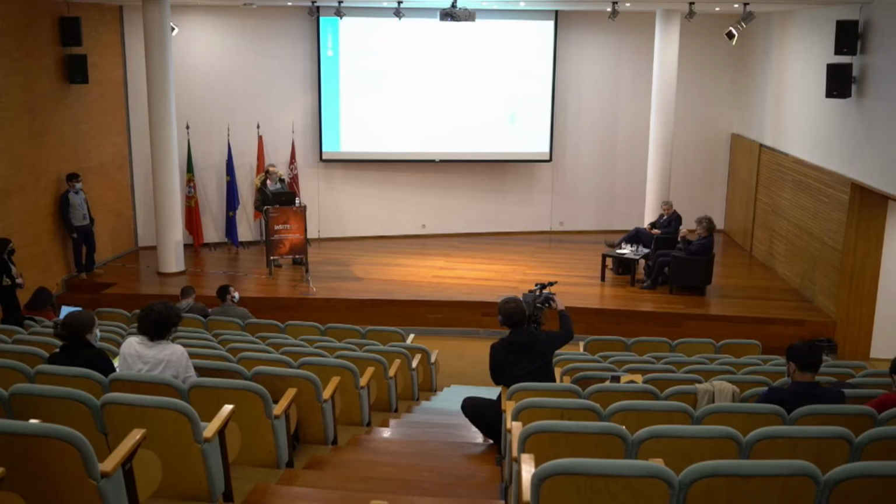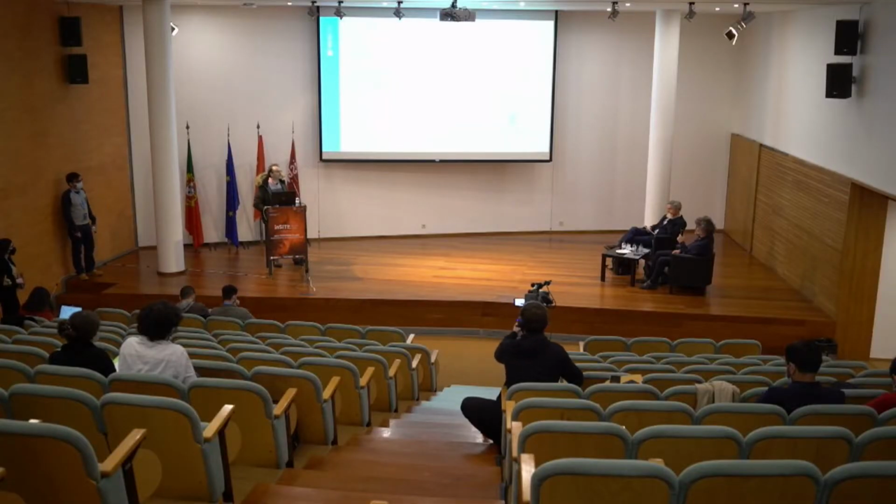You can synthesize a spectra. Yes, that's what we've done. But the problem is that we are not in total control of the theory of synthesizing synthetic spectra, and that's, of course, a challenge. One of the challenges of LIBS is exactly this one, data scarcity.